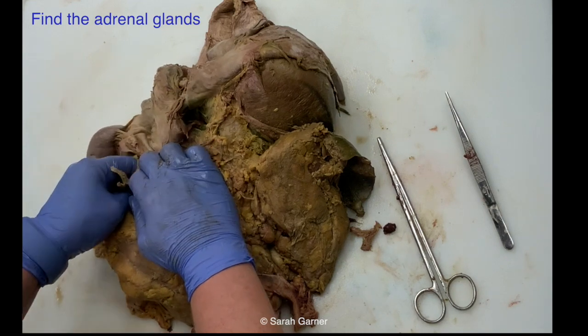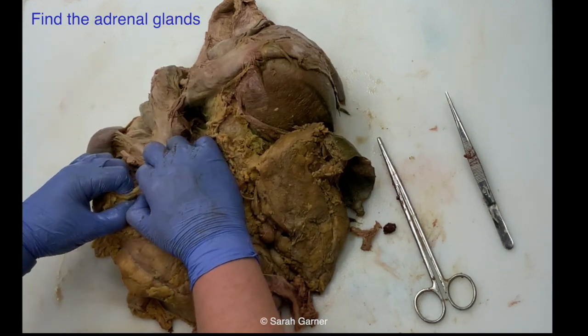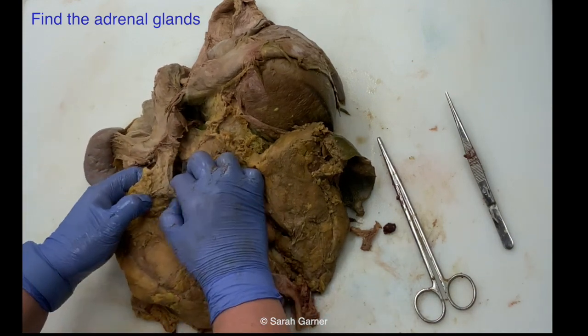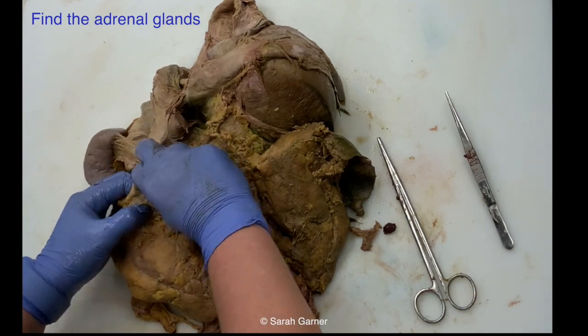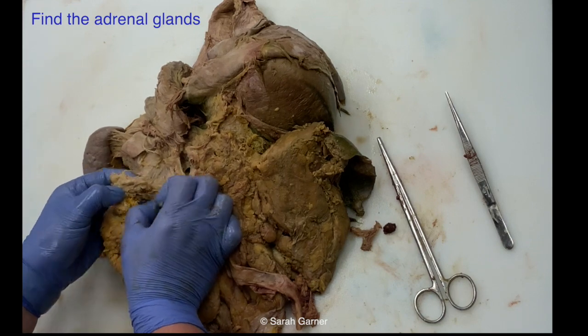But I will tell you, I do the same thing on fresh cases, and I'm still able to find them just by palpating. So just look, or not look, just feel, and don't let your eyes trick you. You should be able to feel the adrenal gland and it should feel different than the surrounding fat, okay?